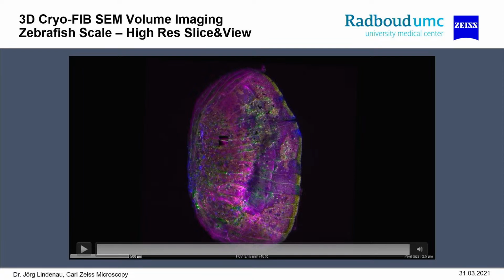Bruno. May I still? Actually, the first is maybe not so important. You said that you know the depth because of your confocal imaging, but what is the set resolution actually in AIRIScan? So, the Z resolution depends on the NA of the objective lens, the one you can use in cryo. So in cryo we have 0.9, so we might be somewhere at half a micron in Z.